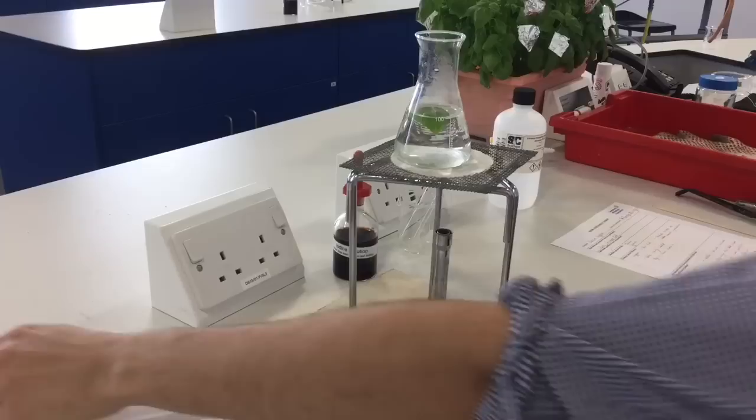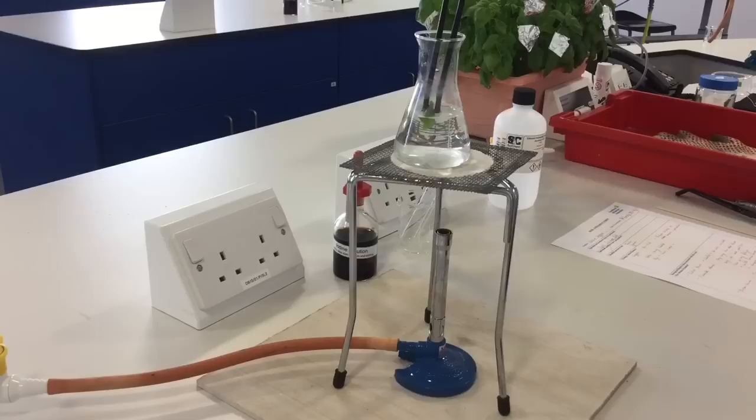Once you've seen a little bit of steam coming out and you're satisfied that it's warmed up enough, you can take your leaf out. Switch off your Bunsen burner—you can light it again later for the next part—and we're going to move on to the next stage.